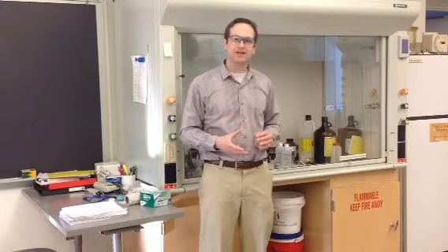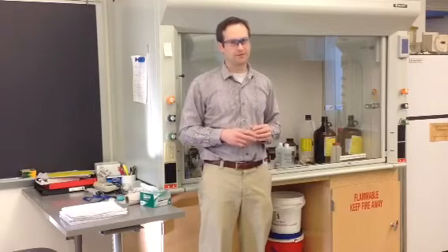Now it says to run it for about an hour. We're probably going to cut that down to about 45 minutes. The other thing is, while that reflux is going on, you still have to do experiment 3 NMR. So once the reflux is running, come up to the front and grab an NMR tube. You've got your product from last lab, and you're going to weigh out in a test tube about 30 to 50 milligrams, 0.03 to 0.05 grams. Dissolve it in chloroform, and then add it to your NMR tube, and you'll be ready to go upstairs and have the NMR run.